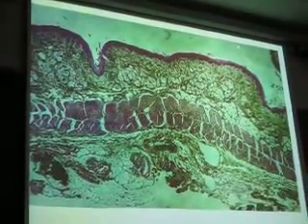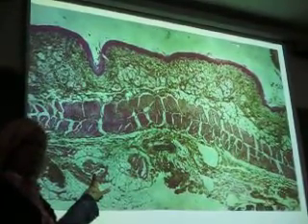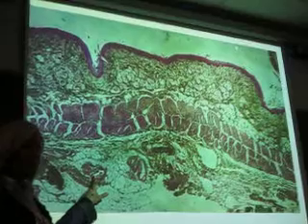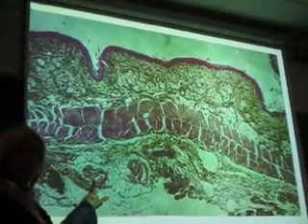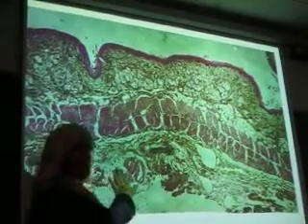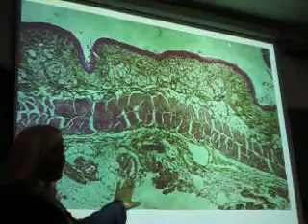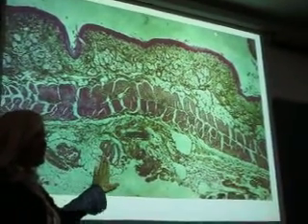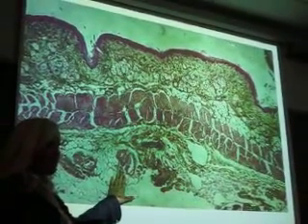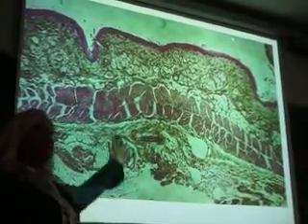So, does this look to you guys to be muscle? No. Does it look like nervous tissue? No. Does it look like epithelial tissue? No. So what type of tissue? Irregular connective. This is connective tissue. This is fibrous connective tissue. So this can't be serosa, because serosa is made of a layer of simple squamous epithelial tissue. So what is this? This is adventitia.